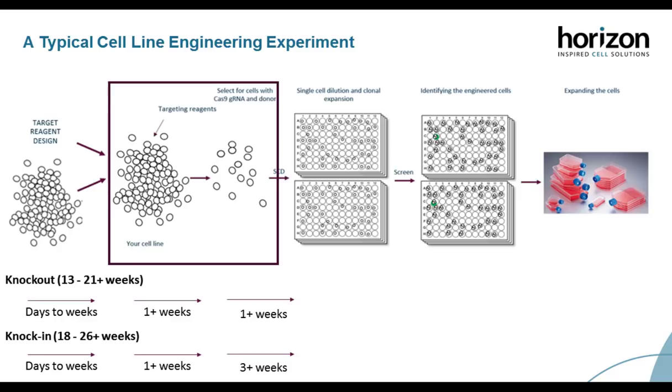So what we always do in the gene engineering department is characterize our cell lines to make sure that we can genetically engineer them and be prepared for these time delays and hindrances to our research plan. So it's just all about the preparation in this area.